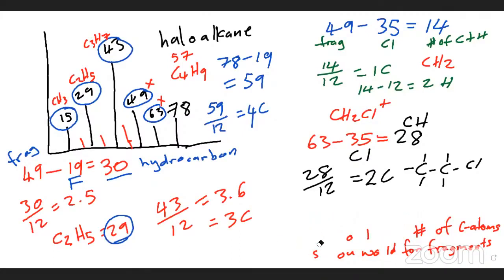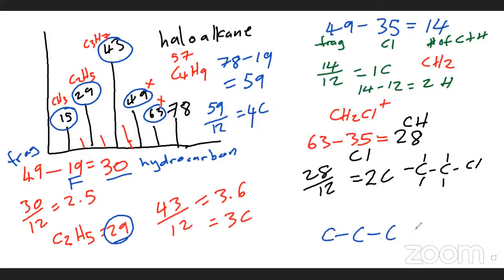Let us check and see. All right, so no, it should have 3 carbons in total, three carbons and chlorine on it. 28 divided by 12 would give two carbons. What was the question exactly? Remember it's a fragment. So the molecule would break here. That is how you would get the two carbons with four hydrogens. So this part is 28 and the chlorine is 35, which would give you the 63. Understand now? Yes, sir.